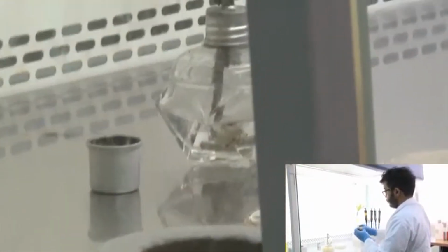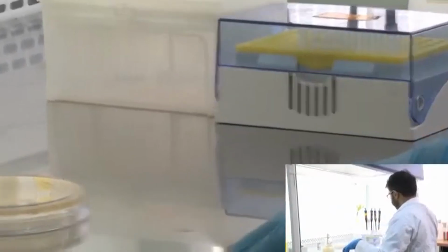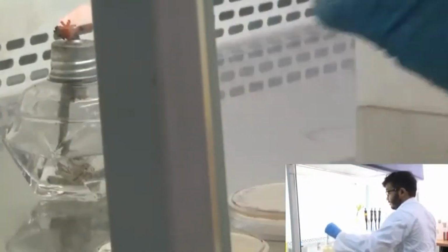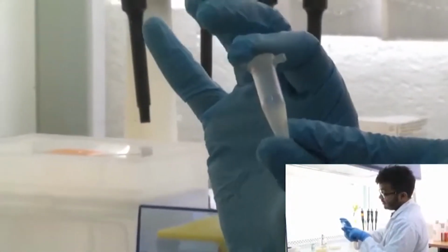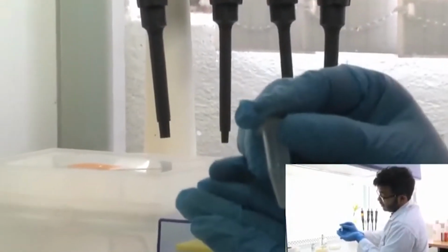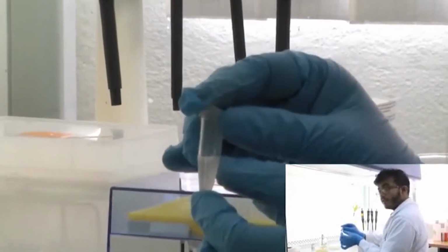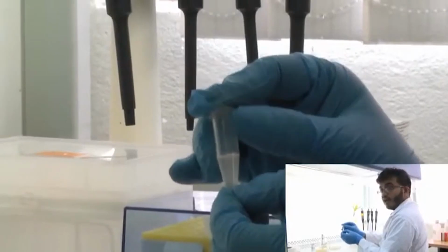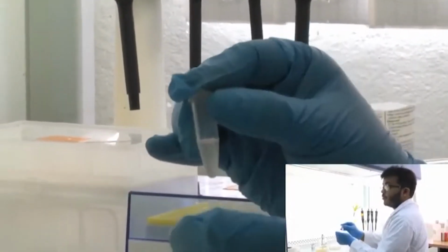First I am going to switch on the burner, the spirit lamp, and so this is the media containing our hopefully transformed cells after it has been grown at 37 degrees centigrade for 1.5 hours. You will notice it has become turbid because of the growth of bacteria. And so this contains 450 microliter of LB, and we originally had 50 microliter of bacterial competent cells, and we had added 1 microliter of DNA.